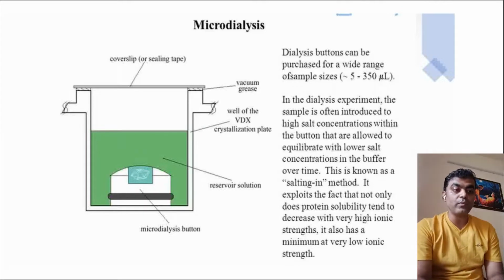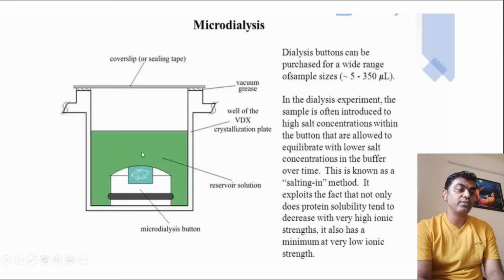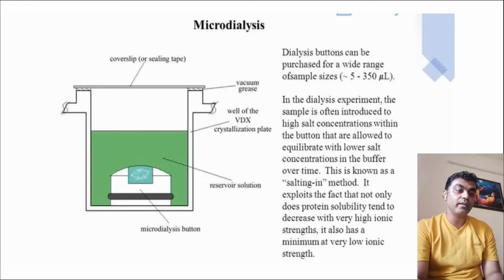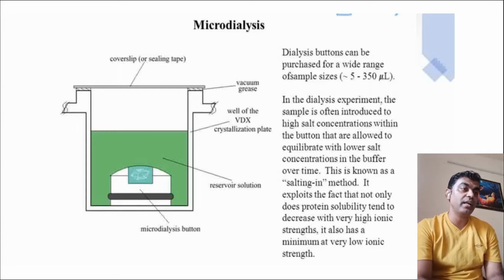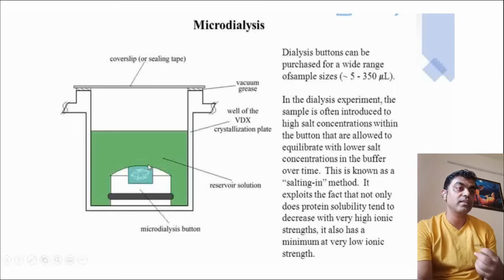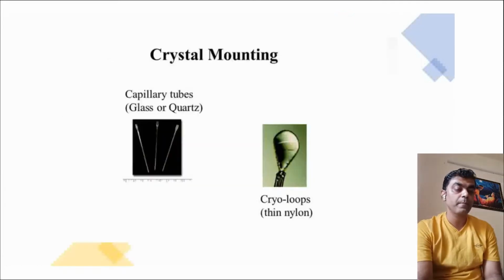So by the process of salting in, slowly the crystallization process will start, because it will try to equilibrate, and this trend will keep on happening, and gradually the crystallization will start.